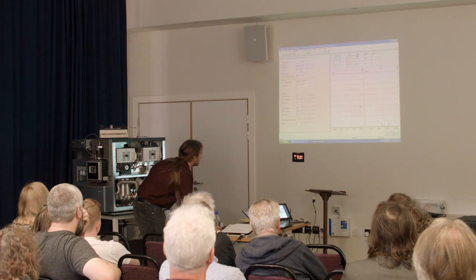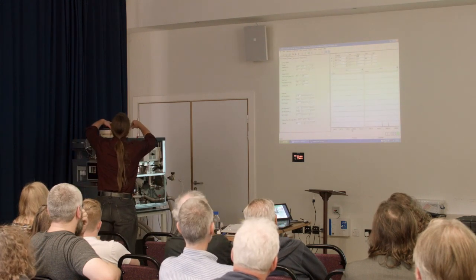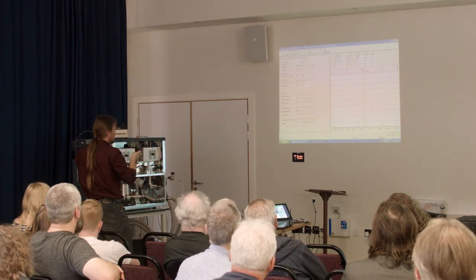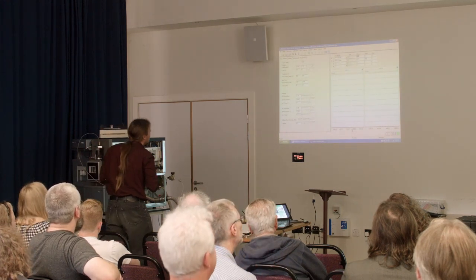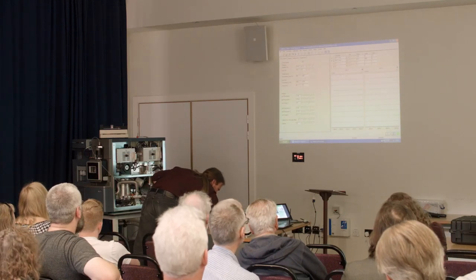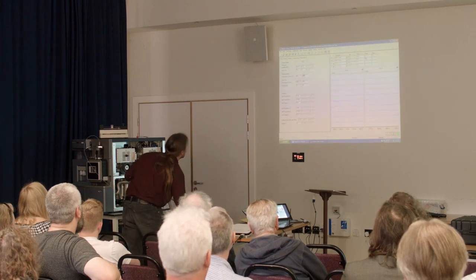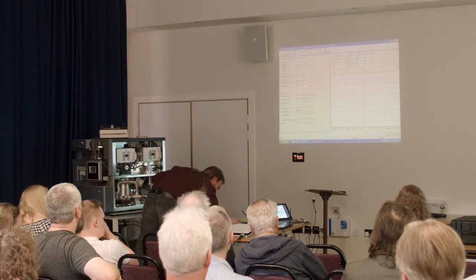Where's our mass 152? It doesn't want to come through, does it? Let's give it a bit of encouragement. So I'm just turning the heat up now. Let's give it a bit more gas.